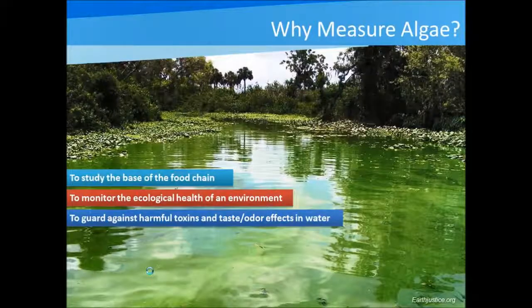Great. Thanks, Danielle. I think a good place to start is why scientists, researchers, monitoring groups, and you folks online really may want to monitor algae biomass. I've come up with three reasons as a starting point. First is that photosynthetic organisms are really at the base of the food chain. So if we can understand how these microorganisms behave in natural environments, it's a very useful starting point for a monitoring program. Second reason is the fact that all photosynthetic organisms contain chlorophyll A.